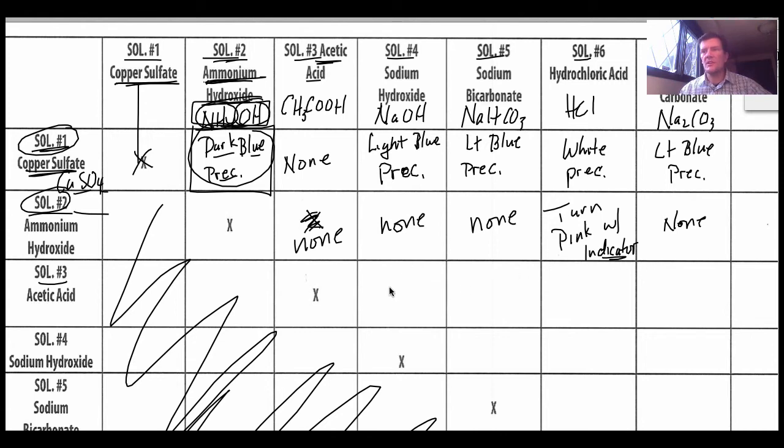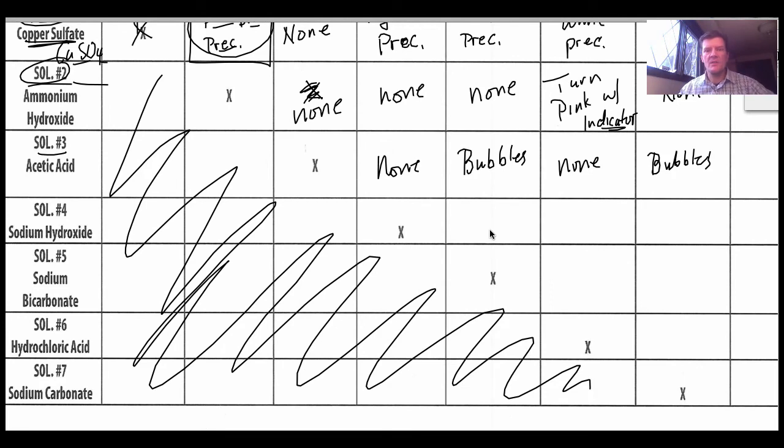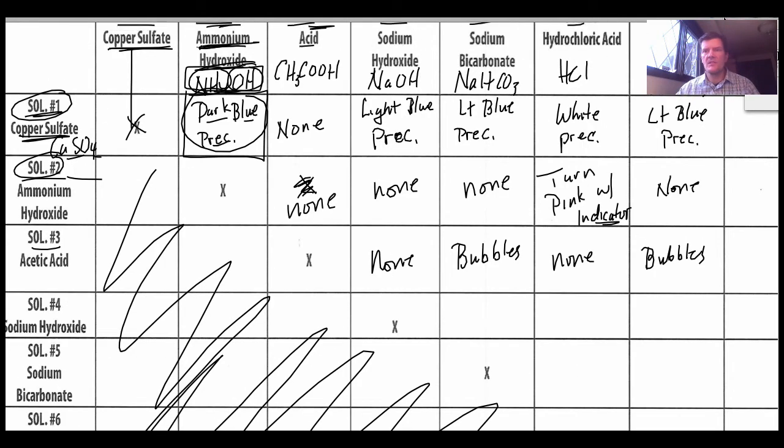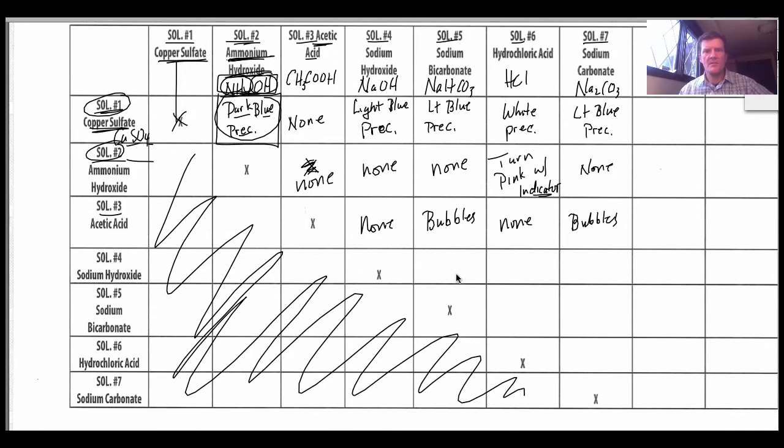Okay. Let's go down to solution number 3 with 4, 5, 6, and 7. So 3 with 4 is going to be none. 3 with 5, you're going to see bubbles. Oh, finally we get some bubbles here. Okay. And 3 with 6 is going to be none. And 3 with 7, you're going to see bubbles. All right. Moving on down, 4 with 5, 6, and 7.